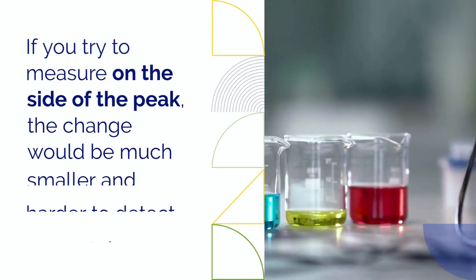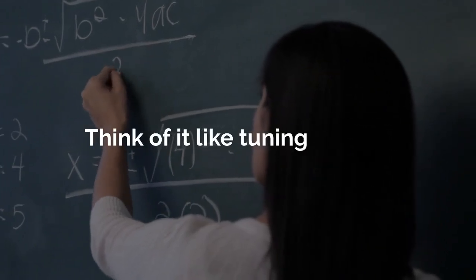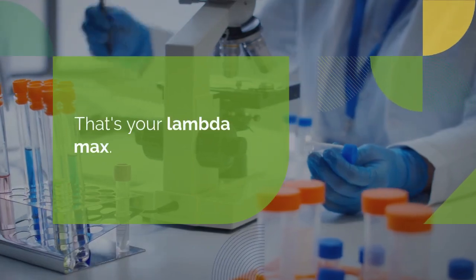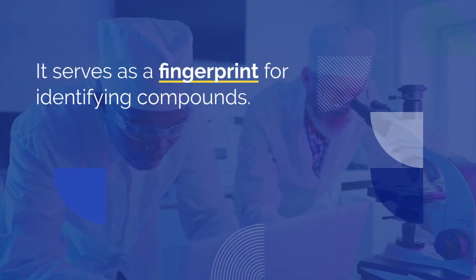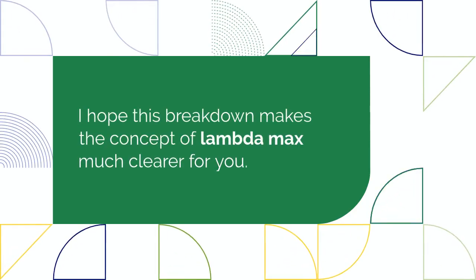If you try to measure on the side of the peak, the change would be much smaller and harder to detect accurately. Think of it like tuning a radio. You turn the dial to find the frequency where the signal is the strongest and clearest. That's your lambda max. So, in summary, lambda max is the wavelength of peak absorption. It serves as a fingerprint for identifying compounds, and it is the most sensitive wavelength for measuring the concentration of a substance. I hope this breakdown makes the concept of lambda max much clearer for you.